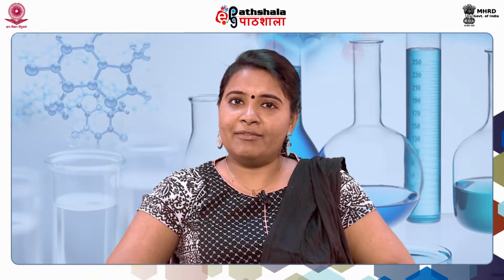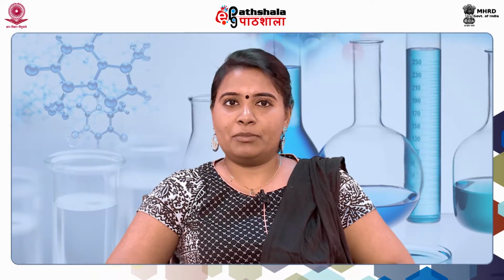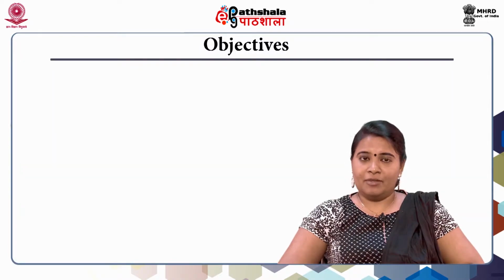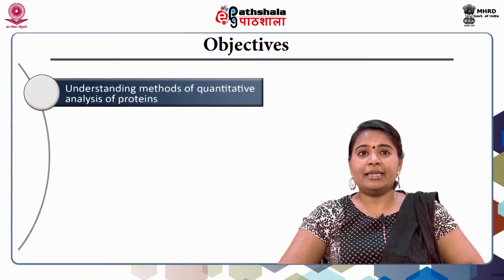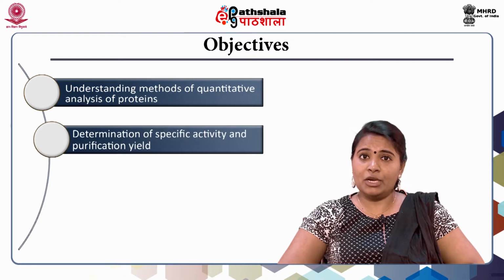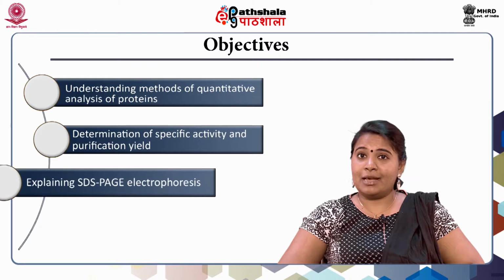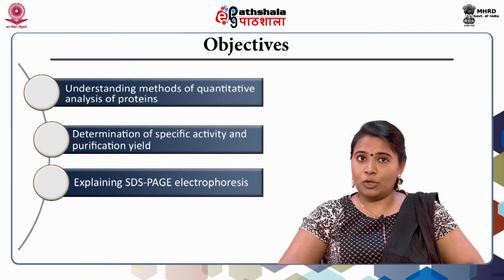I am going to talk today about a very relevant topic, purification of enzyme part 3 from the paper Protein Biochemistry and Enzymology. In today's lecture, we will focus on understanding the methods for qualitative and quantitative estimation of protein, which are essential during each step of a protein purification process. These are like day-to-day lab protocols.